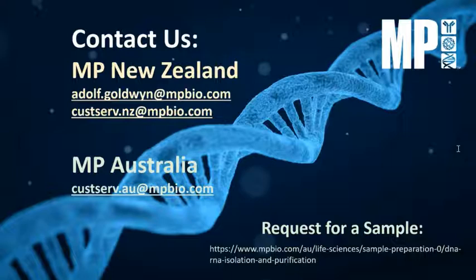We have a question about a low 260/280 ratio for extracted DNA. Any suggestion on this? Are you able to comment on what might cause this ratio to be low, and any suggestions for overcoming it?